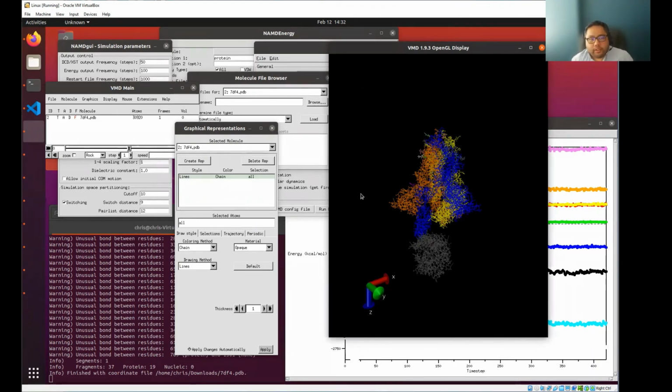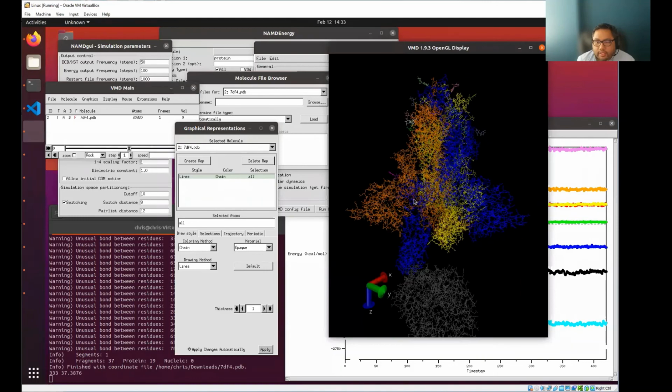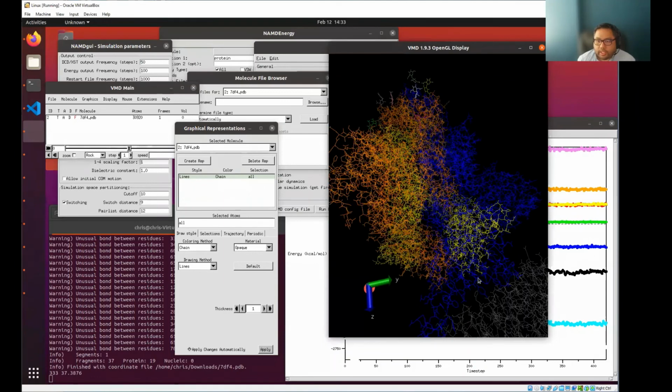Whenever we ran those molecular dynamic simulations, we just ran them on this entire complex. But wouldn't it be interesting to see what if we took this ACE protein and made it stay still, as in it does not have any simulations done to it, but we instead allowed this spike protein complex to just do whatever it wants. So right here, we would allow only that blue part to work its way around the ACE protein and things like that.